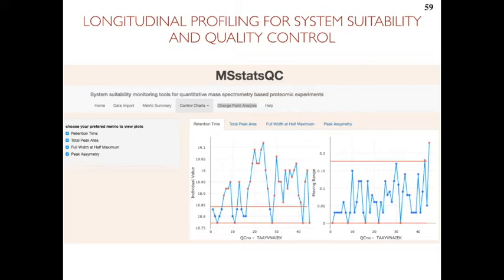And so all of these things have in common the fact that we do it in time, right? So we profile these standards longitudinally, and ideally all the measurements remain as consistent as possible. And if we find some deviations, this is a warning signal or a red flag that something is wrong. Detecting these outliers on the longitudinal profile experiments of standards actually requires quite sophisticated statistical methods.